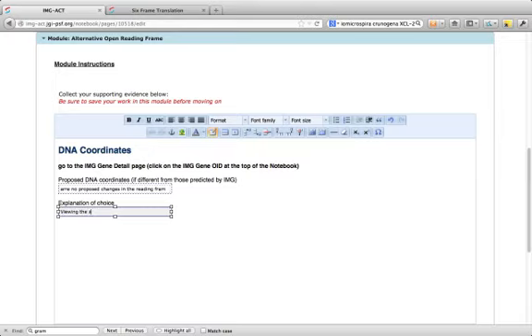Viewing the six frame viewer, looking for start codons and Shine-Dalgarno sequences, and comparing this to the web logo revealed no changes, no evidence for a change.